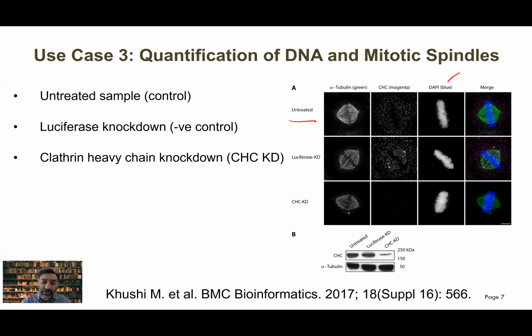The information is captured on three channels. One channel is the spindle. People who have a little bit of biological background know that when the cell divides, this spindle formation happens. The DNA gets duplicated, and the spindle pulls the DNA apart into two, and then two cells are formed.